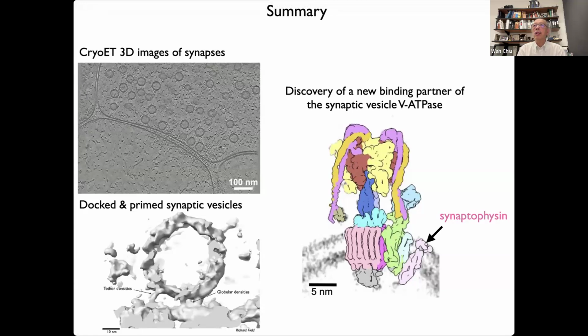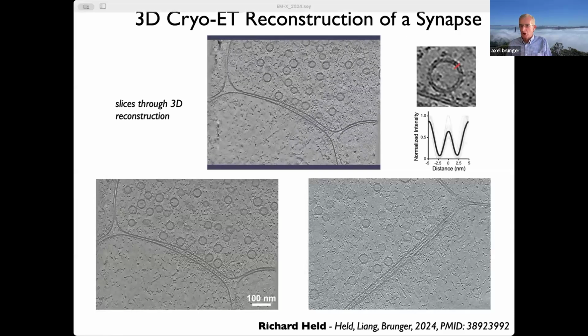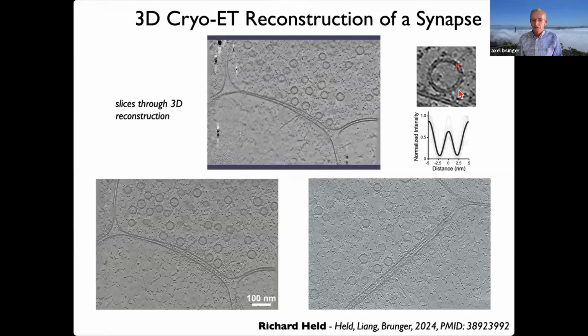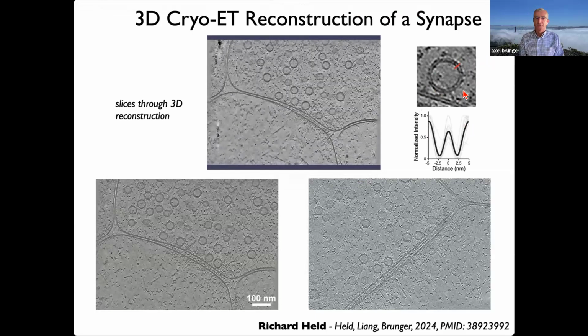The first question, from Dr. Wang, is that on one of your slides you show a profile of the synaptic vesicles along an image. He asked if the image is a raw cryo-EM image or a slice of the reconstructed tomograms. I think it's one of the early slides. I'm trying to find it here. I think it's this one. Okay, there you go. Yes, we're looking at a slice. If Richard will recall, I think that's what we're looking at, yes.